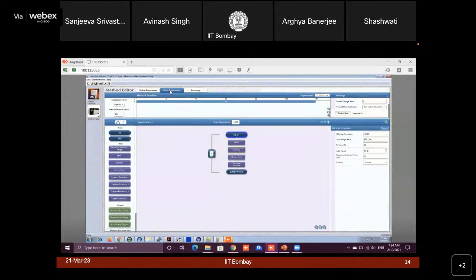You go to the scan parameters. In the scan parameters, these are the basic parameters which are generally used. There are various options starting from the MS, whether you want to do a full scan or selected ion monitoring, whether you want to do MS mode or DIA, which is used for the targeted workflow, and various other sub parameters which can be used, such as the target mass trigger. This can be used in the DIA, means data independent acquisition.